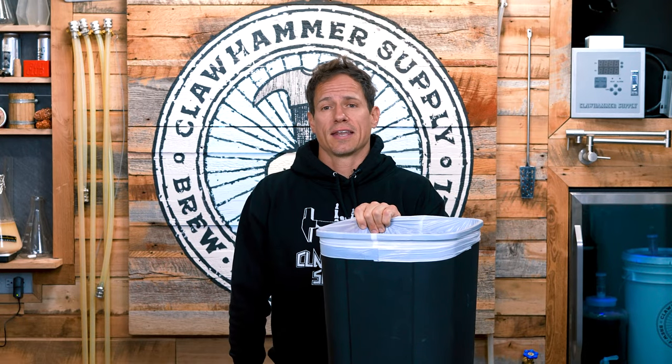The next tool we're going to look at is a refractometer. My best advice is that before you use one of these, you actually just throw it in the trash can and get another tool because these things are absolute garbage. I know I'm going to take heat in the comment section, but I bet a lot of people commenting actually have no idea how inaccurate these things really are. The first problem with them is that they're not designed to easily and accurately measure maltose, which is the primary sugar in beer wort. To use a refractometer for beer, you actually need to build in a wort correction factor to account for the maltose, which literally requires plugging readings from 10 different mashes into a spreadsheet, then using that information to correct all future measurements. Also, turbidity — which is the amount of sediment in beer — and the color of the beer itself will throw off refractometer measurements as well.